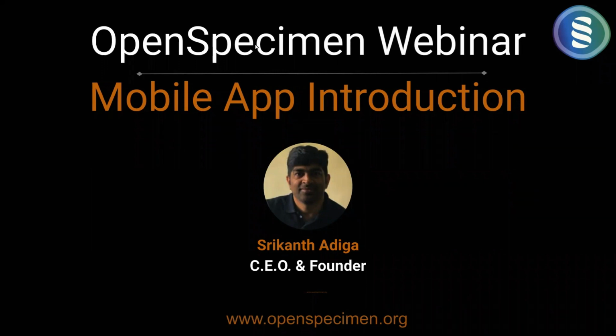Not many know about this app, even though it's been a while since we developed it. We have not made it popular or marketed it so far, but we think it is very useful under different scenarios, and we'd like you all to have a look at it. If you want to try it out, we'll be happy to work with you to configure it for your scenarios to see if it is useful for you. So let's look at why something like a mobile app is useful, as well as what we have done so far.